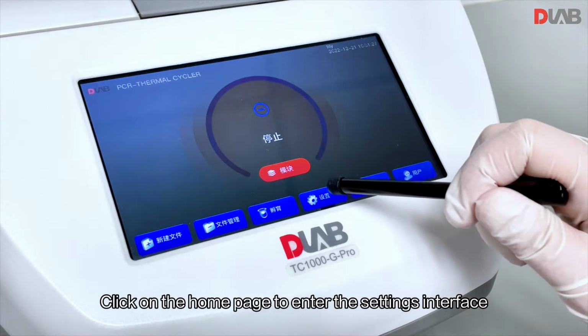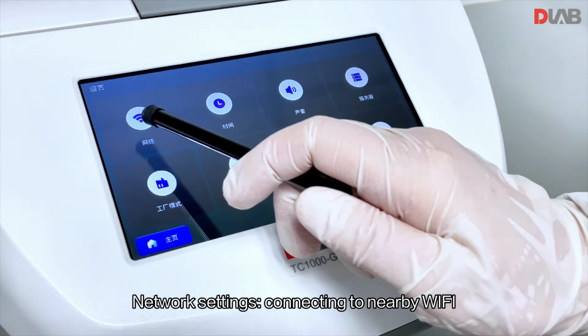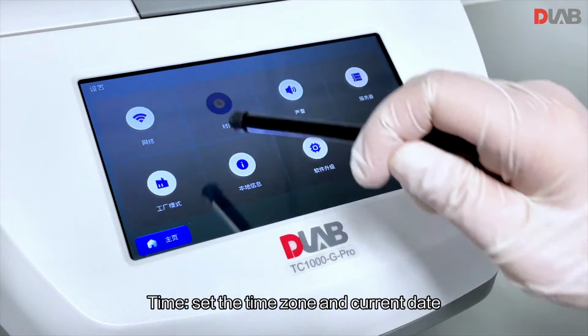Click on the home page to enter the settings interface. Network settings: connect to nearby Wi-Fi. Under the same Wi-Fi, you can control the instrument remotely by using the app. Time: set the time zone and current date.